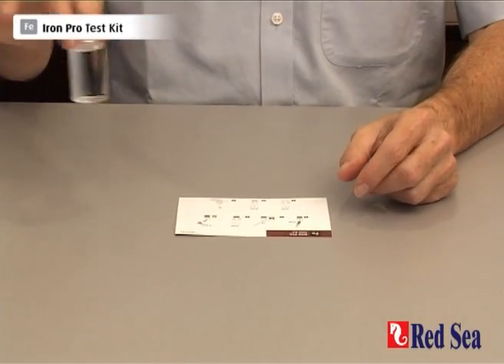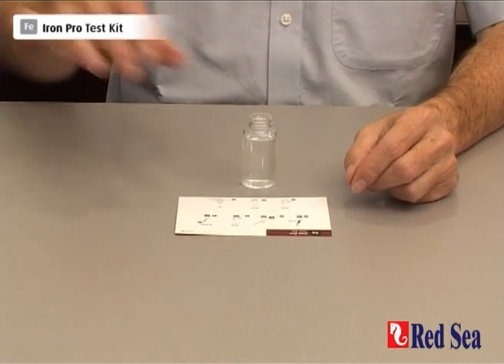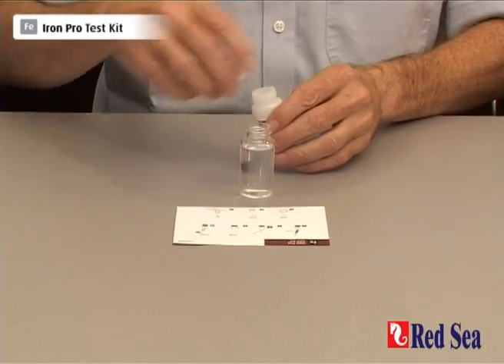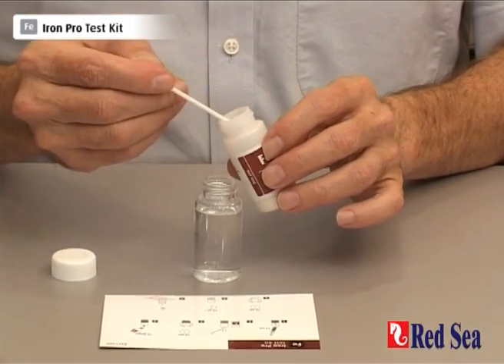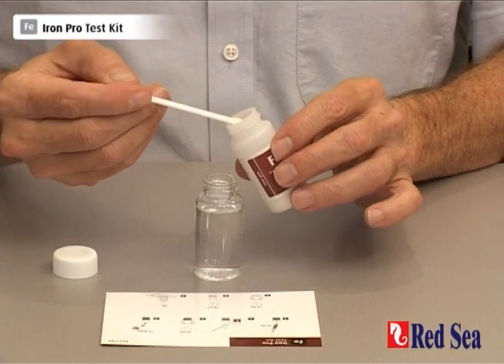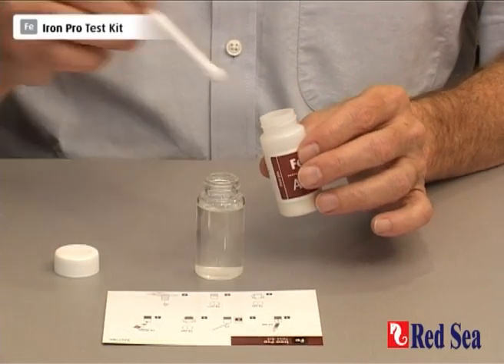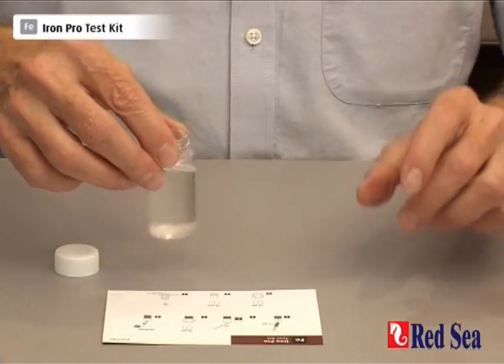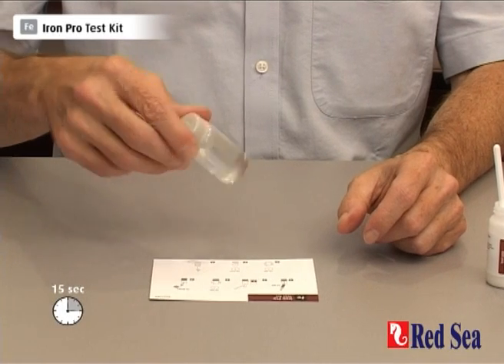I've already prepared a water sample of 17 ml of the water that we're going to test. We need to add one level spoon of our iron reagent A and shake with the lid for 15 seconds.